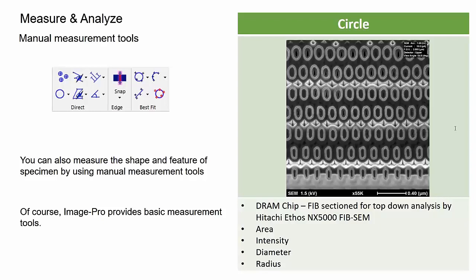I know some people tend to refer to free, open source software, in order to just do circles and lines and grab a quick measurement, or even on screen with their very own EM GUI controlling software. But there's so much more that's available, yet still very easy to use.